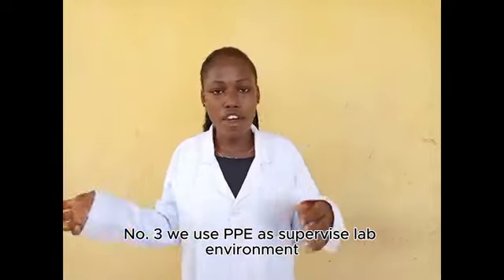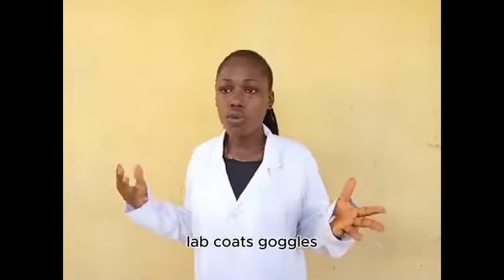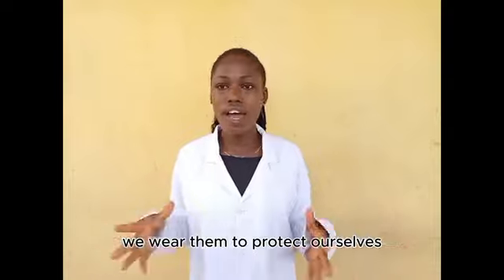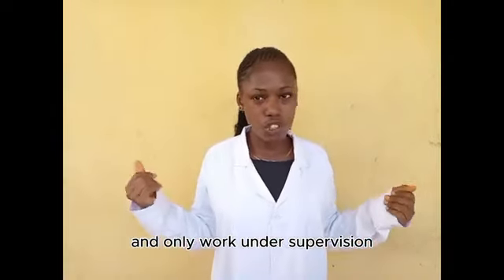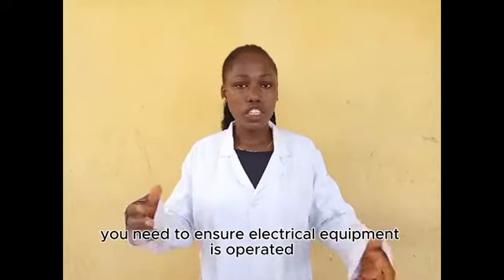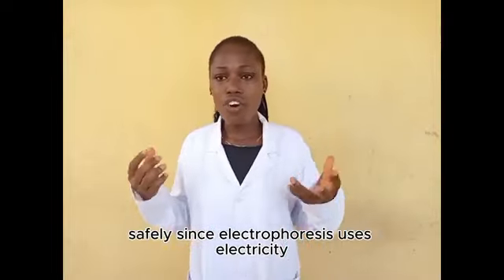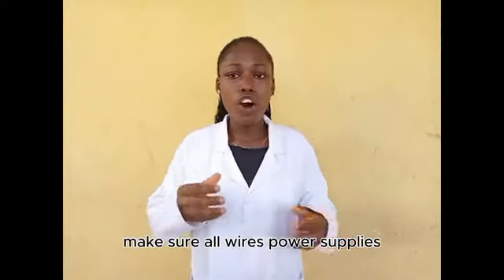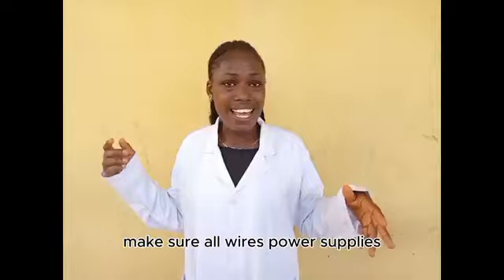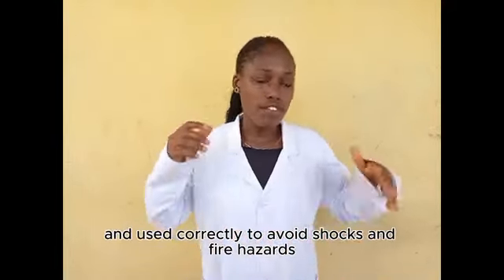Number 3, we use PPE and work in a supervised lab environment. PPE means personal protective equipment, like gloves, lab coats, and goggles. We wear them to protect ourselves and only work under supervision, especially if you're a beginner. Then you need to ensure electrical equipment is operated safely. Since electrophoresis uses electricity, make sure all wires, power supplies, and tanks are in good condition and used correctly to avoid shocks and fire hazards.